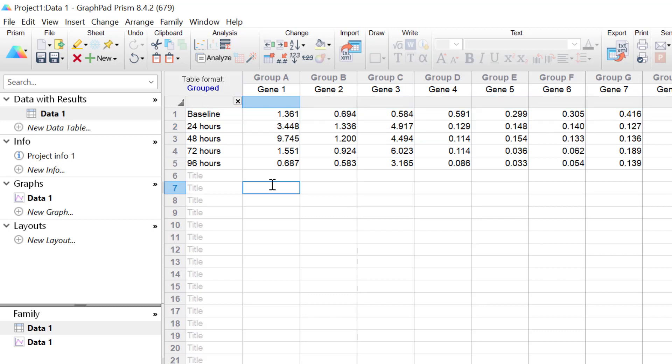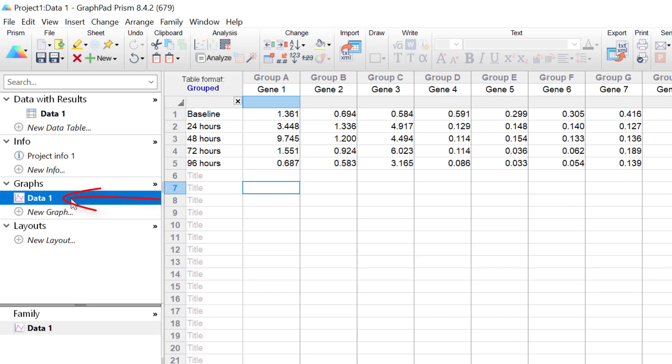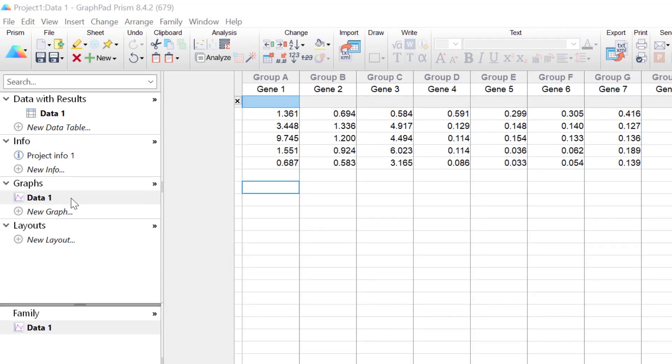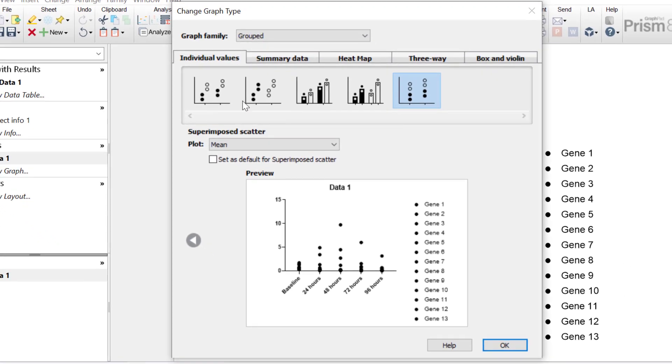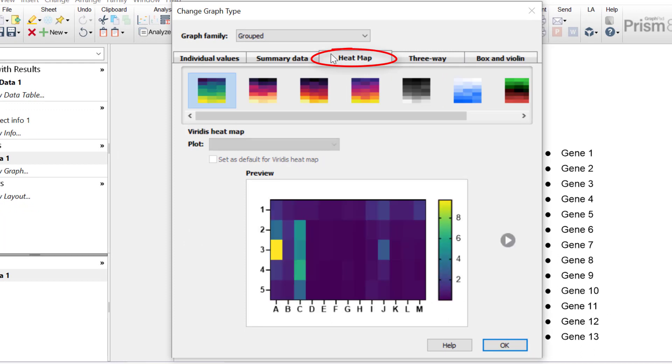Next, I'll create a heat map containing this raw data. It's worth noting that creating heat maps and the different customisation options available are discussed in more detail in a separate video tutorial. But here, I will click on the connected graph sheet in the left-hand window.